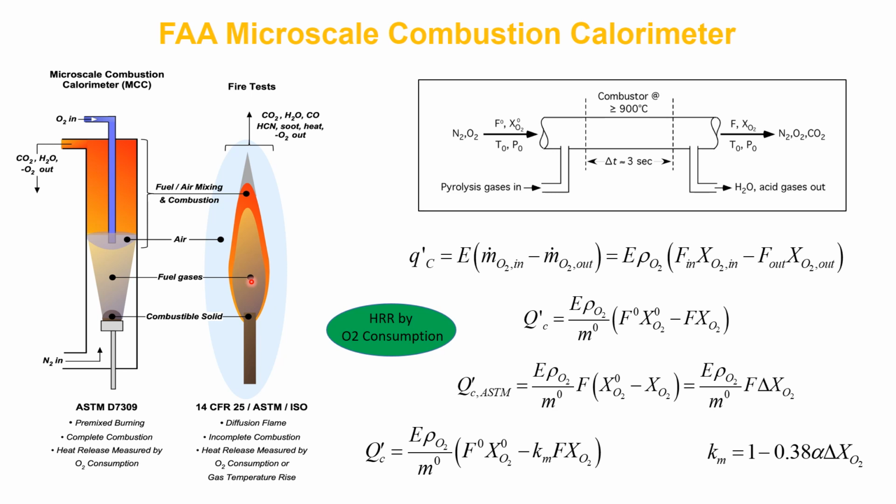Now, there's no oxygen at the sample surface because it cannot diffuse through the flame zone, so it's essentially anaerobic. As volatiles diffuse out, they mix with oxygen from the environment and react, forming complete and incomplete combustion products, along with heat. This heat feeds back into the sample, further degrading it and propagating the reaction.